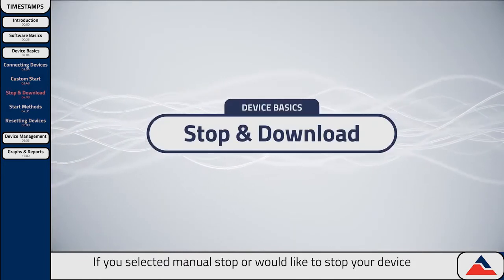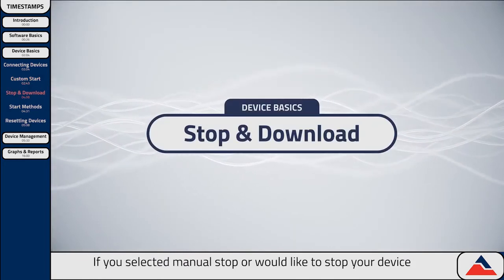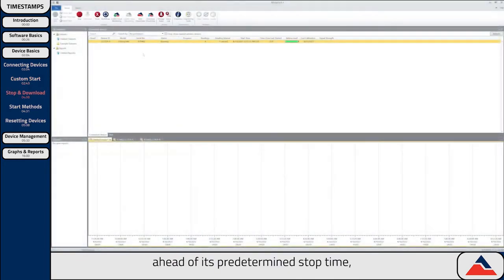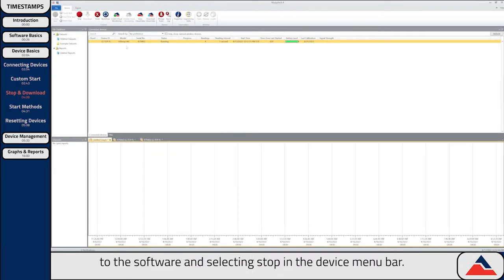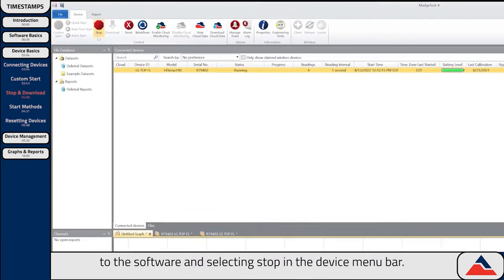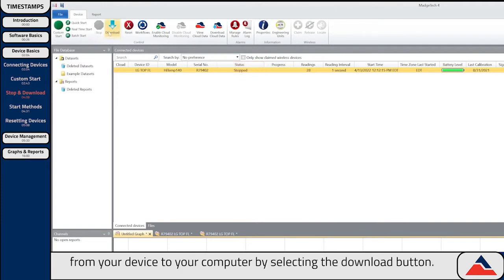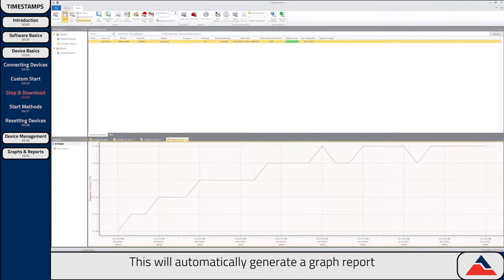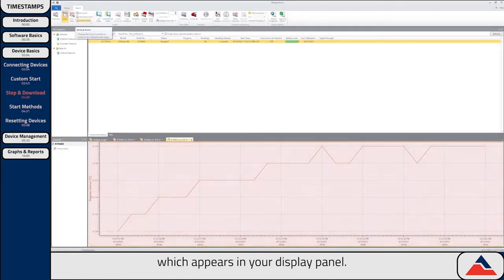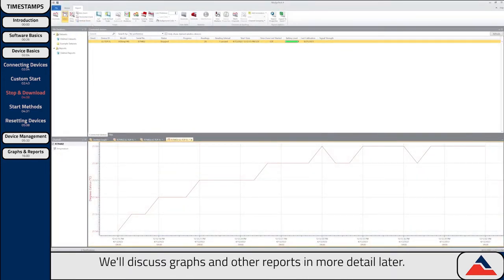If you selected Manual Stop, or would like to stop your device ahead of its predetermined stop time, you can do this by connecting your device to the software and selecting Stop in the device menu bar. Once the device has stopped recording, you can then download data from your device to your computer by selecting the Download button. This will automatically generate a graph report which appears in your display panel. We'll discuss graphs and other reports in more detail later.